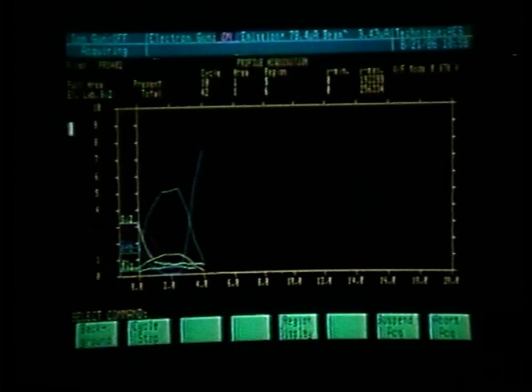Once again, the ability to suspend a profile and acquire either survey scan, multiplexes, maps, or line scans is very powerful. When we get to interfaces, we're not sure what elements are present and what elements are not present. Taking survey scans or maps and line scans can provide added information which can help us resolve the problem.